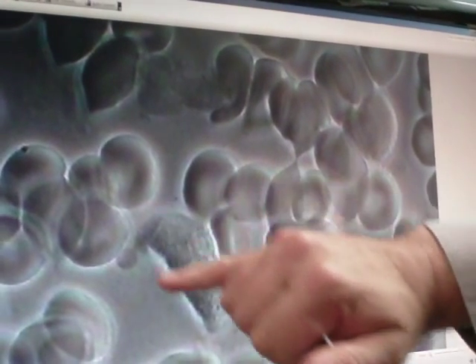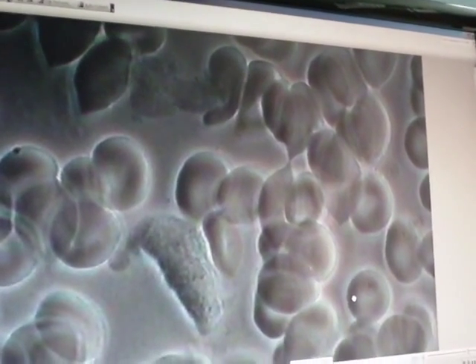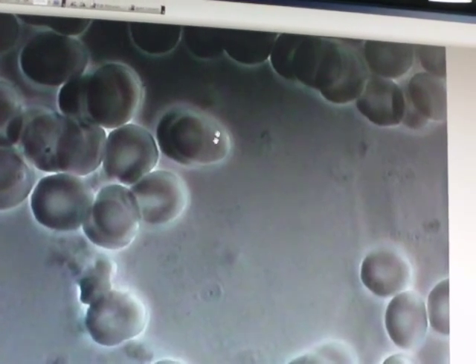We also see this nice big white cell, much larger than before, where it's fighting on both sides here at both ends. See the nice clear space here? There's no lines showing that liver stress. So that means the liver is actually being supported.